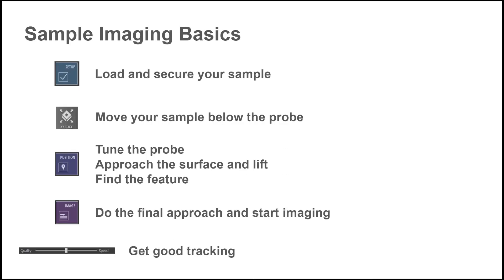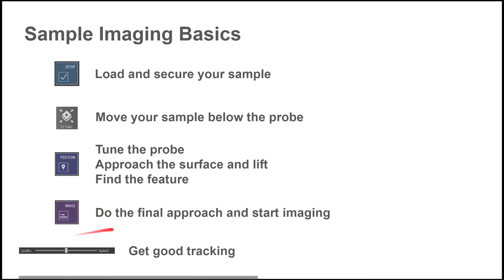Now that the probe is installed and the laser is aligned, you can start making the measurement. First, load your sample, securing it either with the stage vacuum or the magnetic sample holder. Then move the stage until the sample is below the scan head, and make sure the probe is above the sample. Once you hit the position button, the probe will approach your sample — if you are not above your sample, you risk damage to the tool. Hit the position button to tune the probe and approach the surface. After the approach, the scan head will lift and you can find the feature you want to image, with the tip 100 microns above the sample. The next step is to actually image the sample surface, where the final approach is performed and the tip generally ends a few nanometers above the sample.